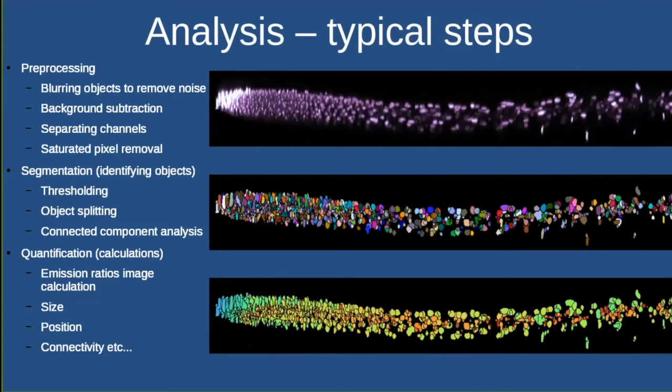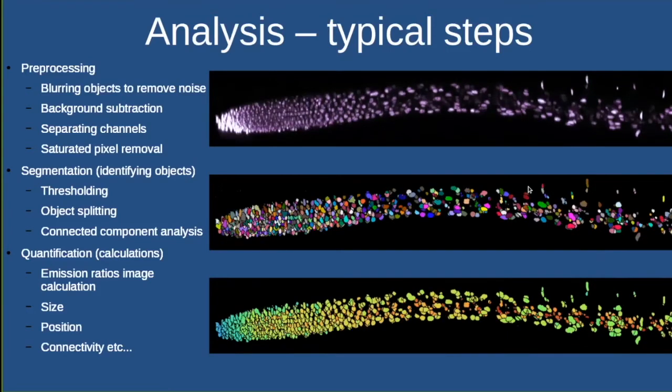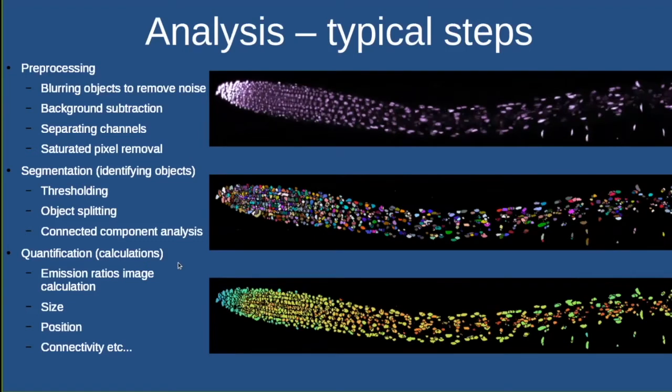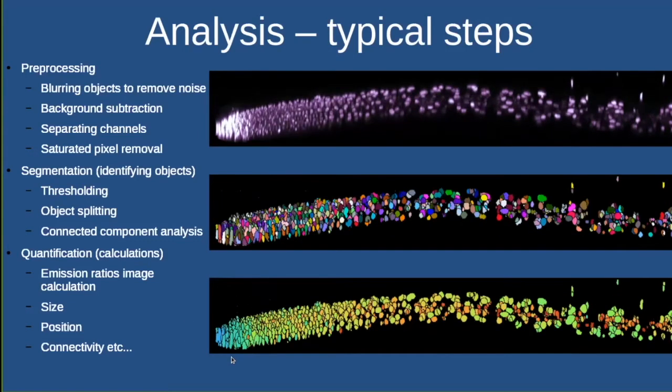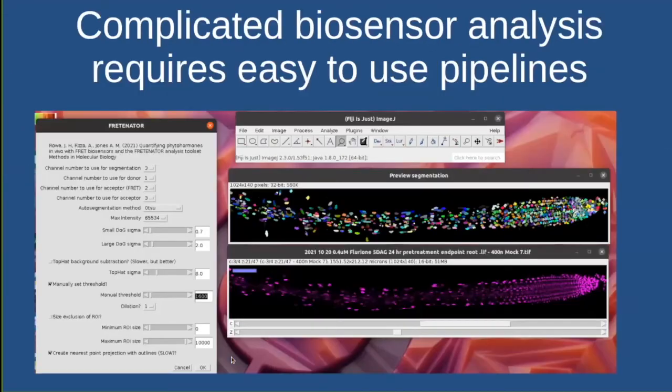And you can do all of these steps in Fiji, but having a good analysis protocol and good analysis tools will mean that rather than clicking through each of these individual steps, which might take you hours for each image, you might be able to analyze it in minutes, which is why we spend a lot of time developing tools that allow you to do this as well.